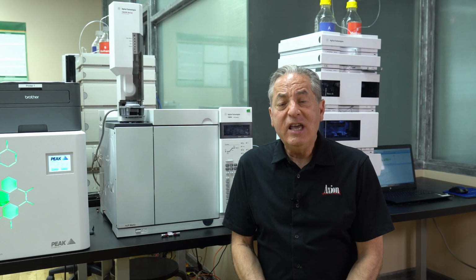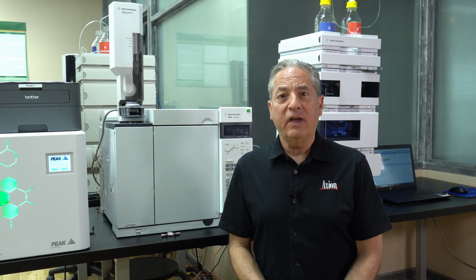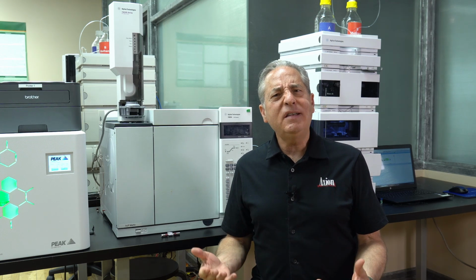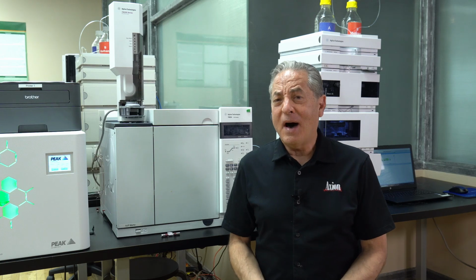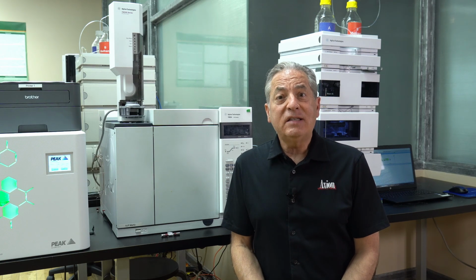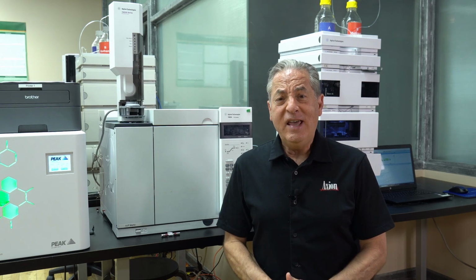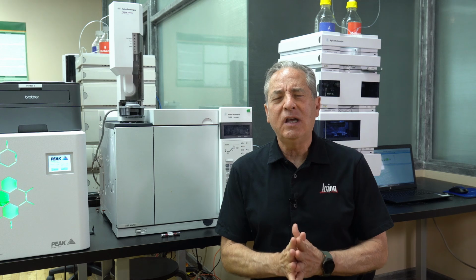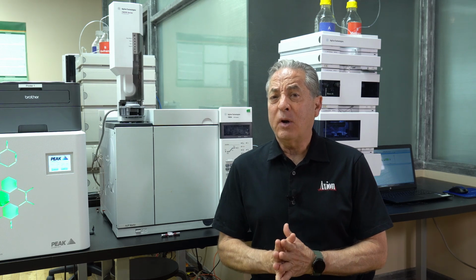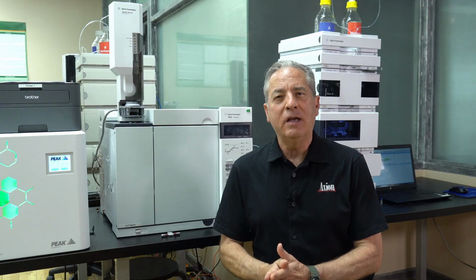So the first thing the interviewer is going to want to assess is your basic knowledge of chromatography. So they may ask a question, what is the primary principle behind the techniques of HPLC and GC? Now the answer to that question is that these are separation tools, and what they do better than any tool in the world is they separate complex mixtures into pure compounds. We separate to identify, we separate to quantify, we separate to purify, but step one is to separate.